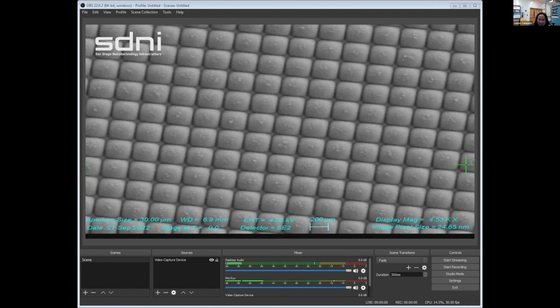So for the people that wanted to stay, the individual squares that you see here are individual camera pixels, like from your phone camera. They're made of silicon, which is one of the main semiconductors used in the electronics industry. I think this is a really cool image and something students would be interested in, because we all have cameras these days, whether on a phone or a tablet.